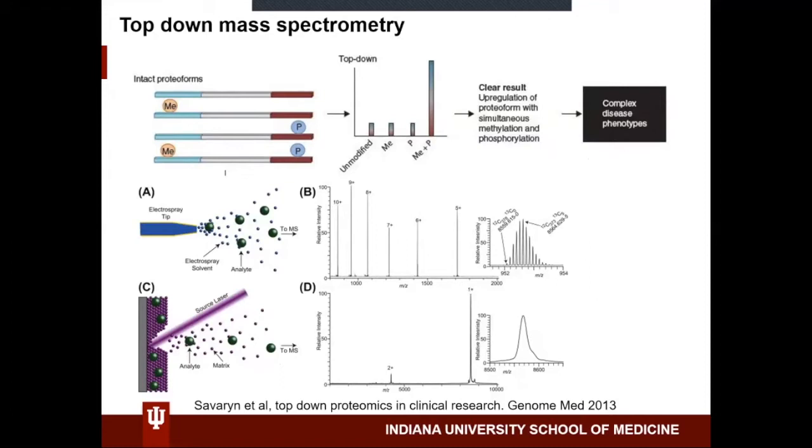And I have here kind of the comparison of ESI versus MALDI. MALDI is often used for this intact mass where you only get a single or maybe up to a triple charged ion of a protein, and it's kind of lower resolution, but can give you an intact mass. And electrospray ionization gives you these multiply charged species where you can see the full envelope of isotopes. And then you can fragment the isotopes and identify where specific modifications are occurring on a protein.